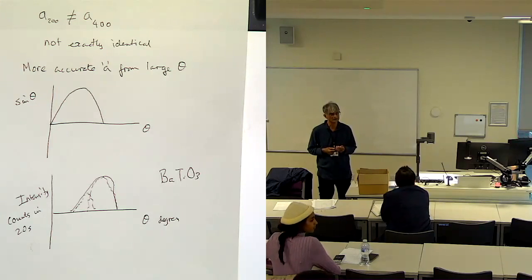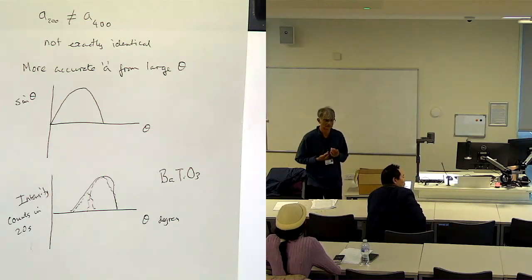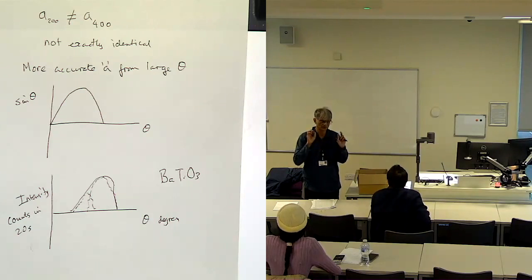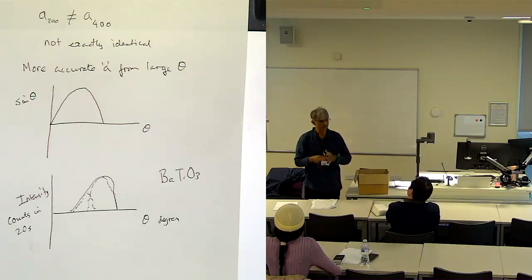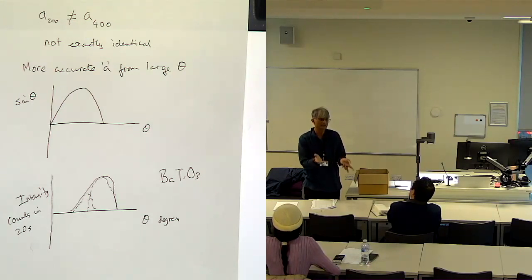With the size of the crystal being relevant, I presume that's due to the number of planes within the crystal. It's due to the number of planes present within the crystal. In the powder, you mean? No, the planes are exactly the same, but the Bragg law is only satisfied properly if the crystal is deep. And as soon as you make it smaller and smaller, you will get wider and wider this diffraction angle. And the other reason which we have covered actually is strain present inside the crystal. But I have no evidence that the barium titanate has strain.